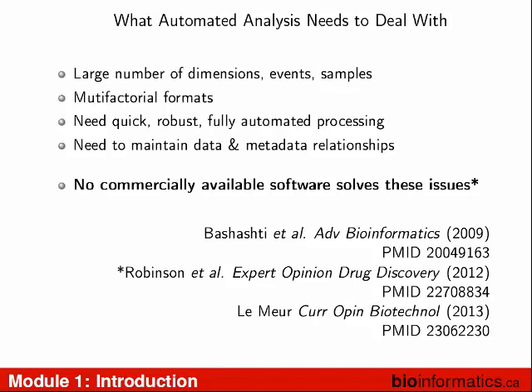There are lots of different data formats. So it's not just the FCS files, it's all that other data that goes along with those FCS files.